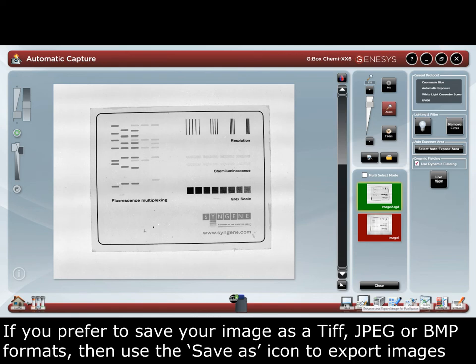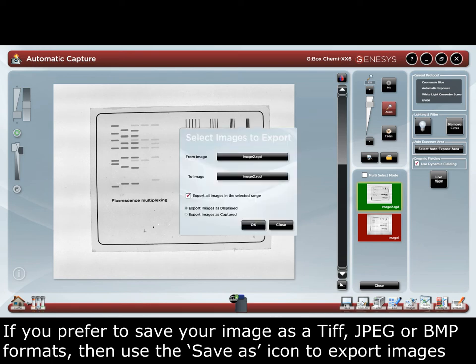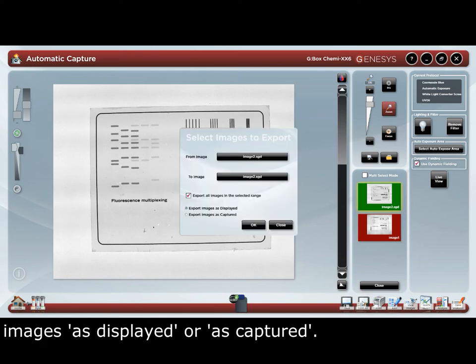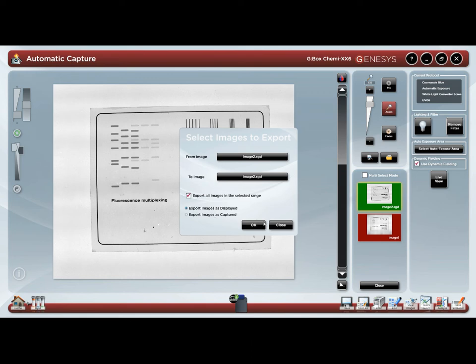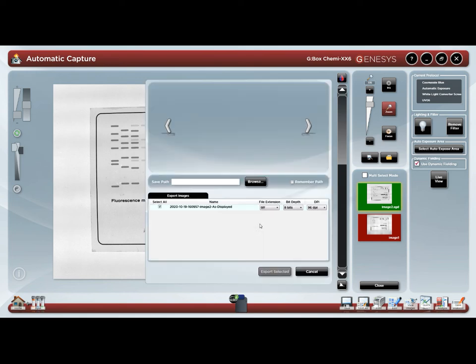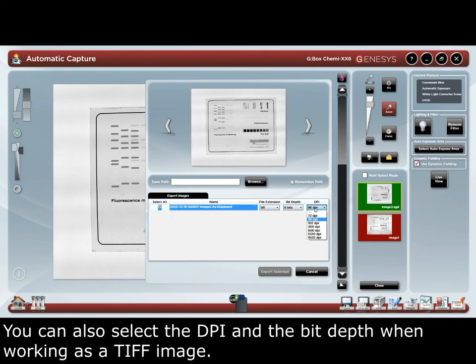If you prefer to save your image as a TIFF, JPEG, or BMP format, then use the Save As icon to export images as displayed or as captured. You can also select the DPI and the bit depth when working with a TIFF image.